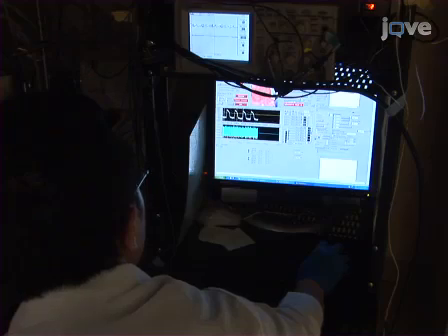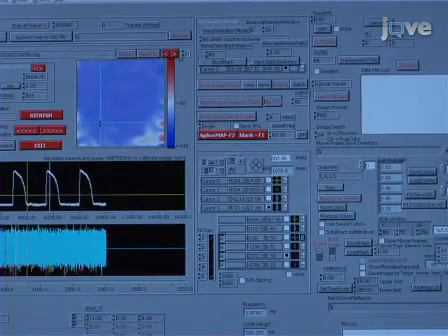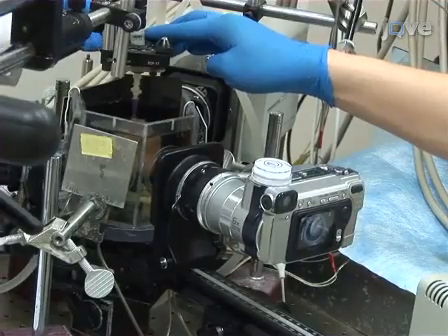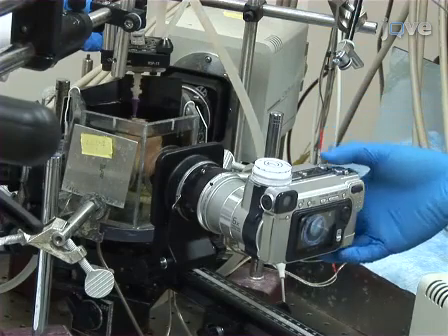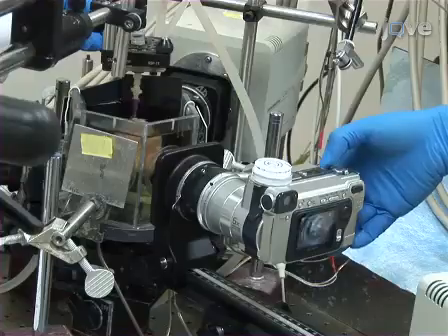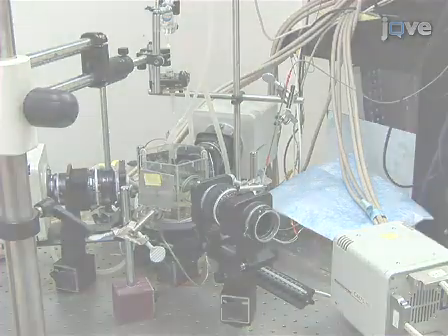Make sure that there are no motion artifacts in the optical signal and that the signal-to-noise ratio is sufficient for subsequent data analysis. When finished, turn on the room lights and make a photographic record of the heart by taking one photograph for every 10 degrees of rotation from a camera positioned at the location of one of the PDAs. Then proceed with cleaning up the perfusion system.